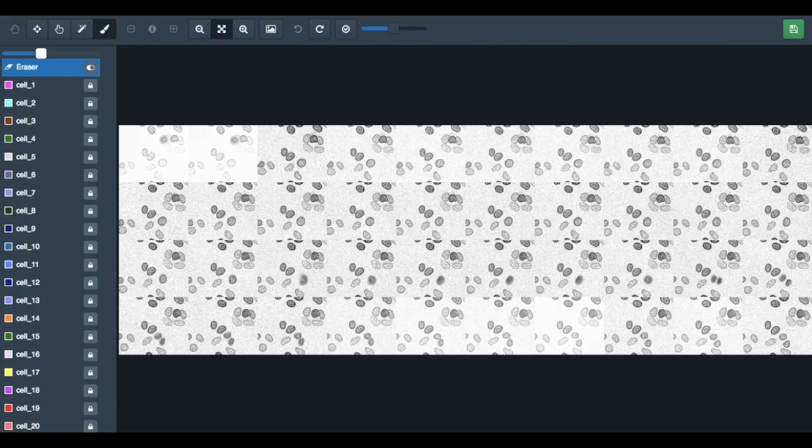Hi everyone, this is a quick video explaining how to properly label cells for this job. Our team is working on a computer program that will be able to identify and track cells in a microscopy video. To do this, we've turned some of these microscopy videos into sets of images and need your help in labeling the cells. If the cells are labeled well, the computer program can learn how to label and track the cells by itself. Here is an example of the type of image you will be asked to annotate.